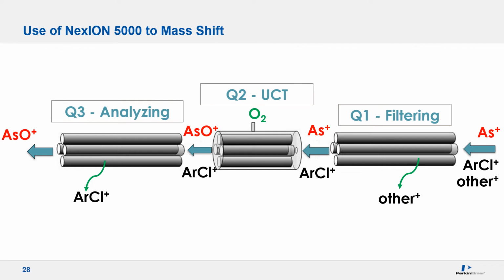When analyzing waters and soils, elements such as arsenic, selenium, and phosphorus are necessary to measure, and in some places the required detection limits by governing bodies and agencies is being lowered. These elements have interferences that are produced in the plasma, such as argon chloride on arsenic, argon-argon dimer on selenium, and nitrogen oxide on phosphorus. These interferences can be high in concentration and difficult to remove.